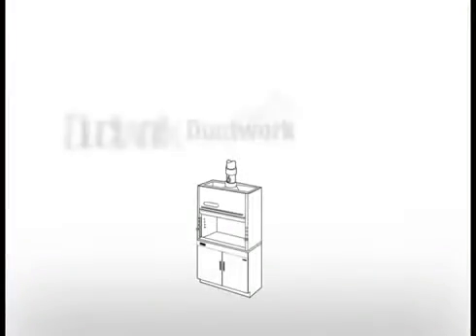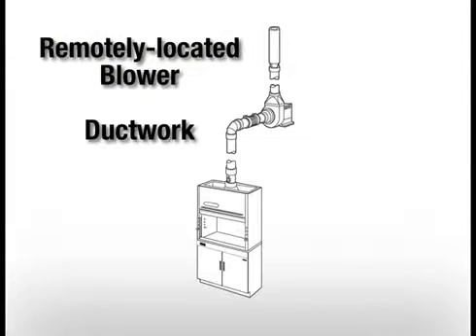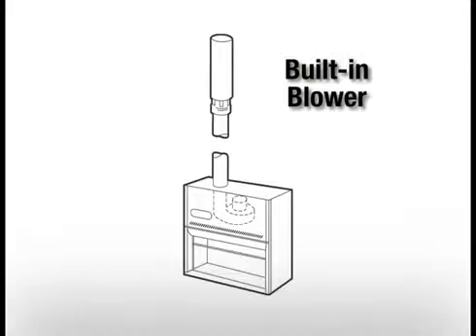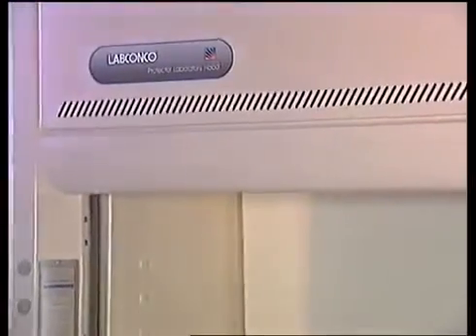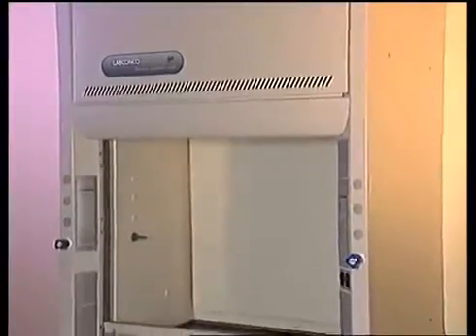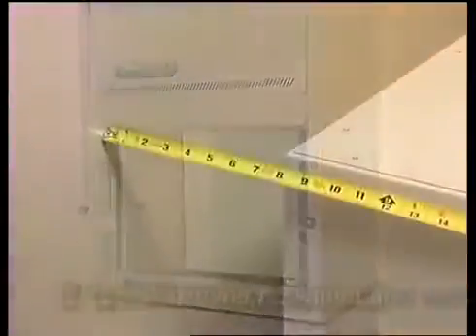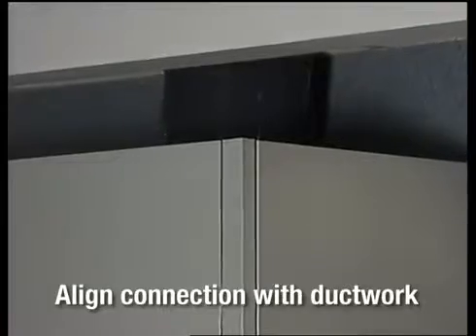As with any hood installation, ductwork leading from the hood to the outside and a blower, either remotely located or built into the hood, are required. Ductwork and blower installation is not shown in this video. Before placing the cabinet and fume hood in their permanent locations, ensure that at least 8 inches of clearance exists between the base cabinet and wall, and the hood's exhaust connection will align with the ductwork.